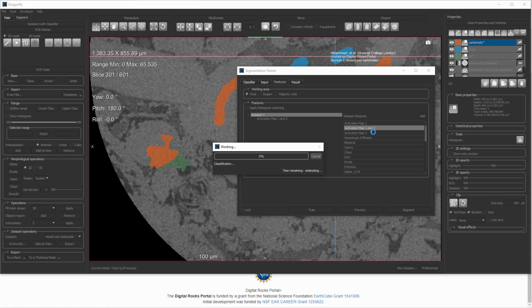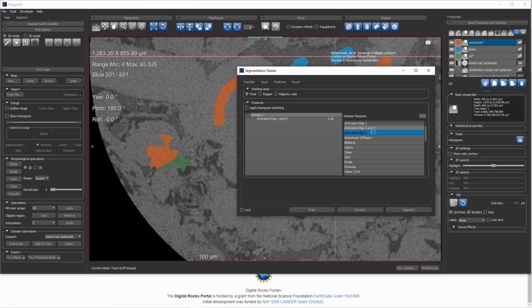So we have provided the activation map 1 and 2 from a large class of scientific images, and you can use that. And so it is not programmed by programmers. It's determined by a deep learning model to be highly differentiating features. Now, it's not trained on this data set. However, you could go over into this data set and train a deep learning model, and then you could extract out this activation map and add it as a possible data set feature here.